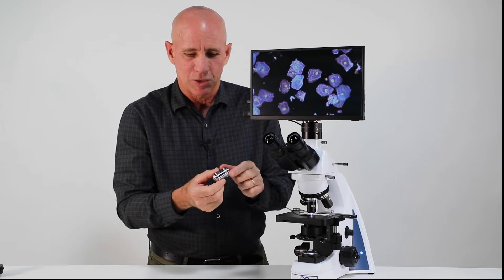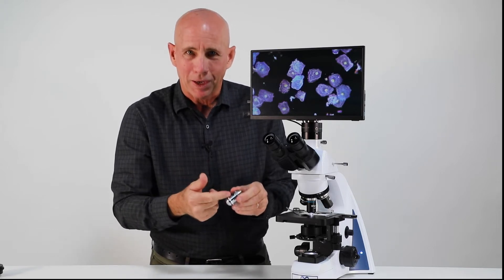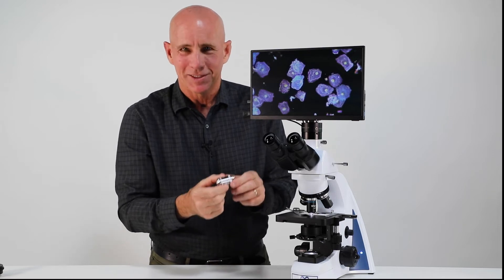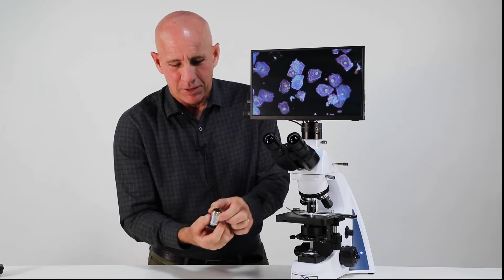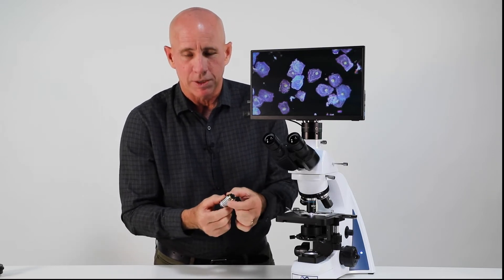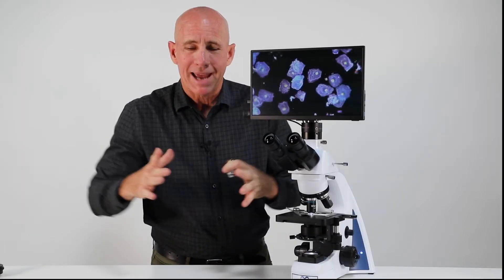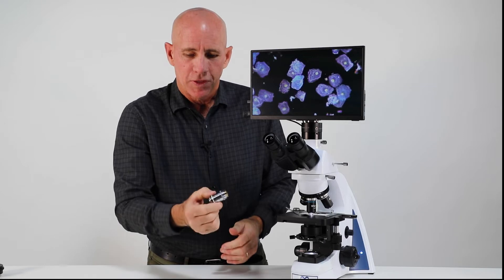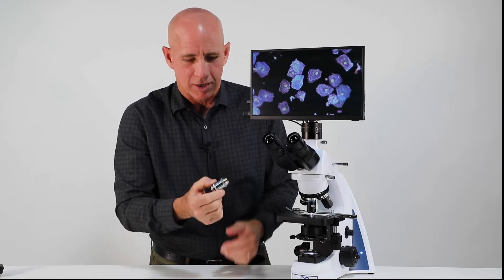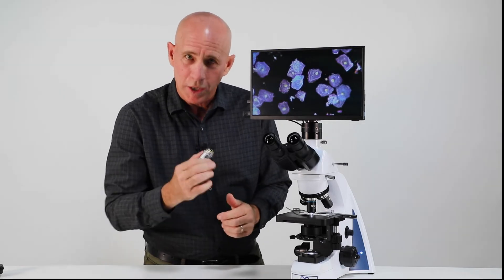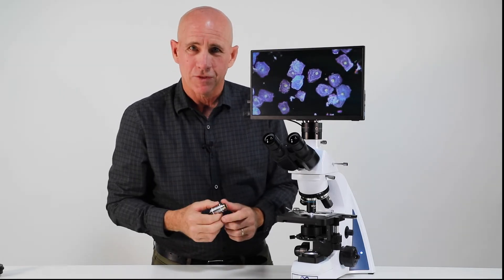But the 100X will not work in dark field unless you get the special 100X dark field objective. Now this one, to be more specific, is a 100X infinity plan dark field oil objective. So that's a lot to say. But the interesting thing about this is it has an iris on it and it can open and close. So basically I can bring my aperture down so this will work in the dark. So we will install this and then you will see how the 100X dark field objective can work.